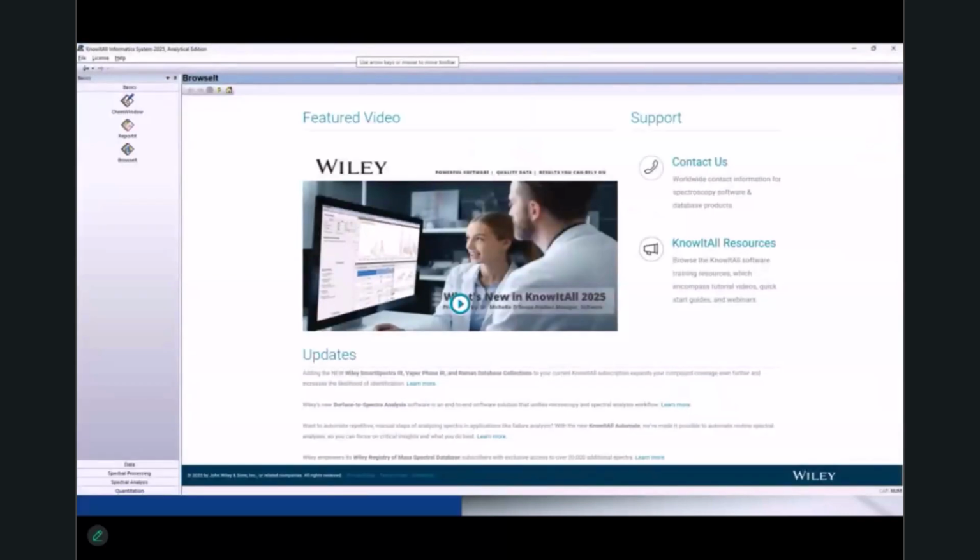So, this may be your first look at KnowItAll, and before the demo, I will do a brief introduction. So in our basics, we have Chem window, report it, and browse it. Chem window is for basic structure work. I'll show this a little bit later. In our data tab, we have the meat of KnowItAll. So here we have ID expert for quick identification, search it for spectral searching, and mine it for database work.